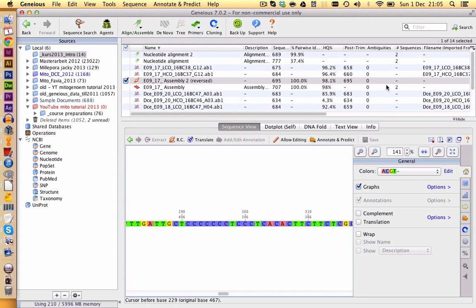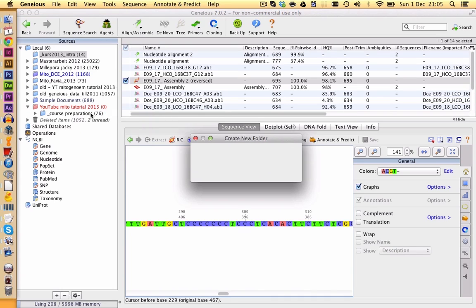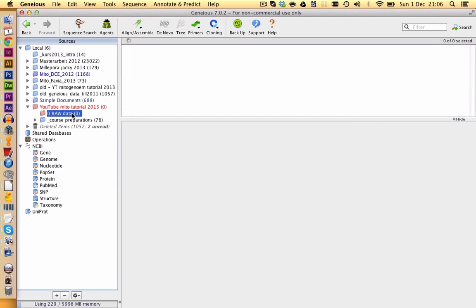And for our course, it's important to now import our next generation sequence data, but I would recommend to have a really clear folder structure. So the first thing we're going to do is to create a new folder. You can right click in here and we call this one zero raw data. Click on OK, because in here we will store our next generation data. We will keep a numbering here, so we have everything in a chronological order.